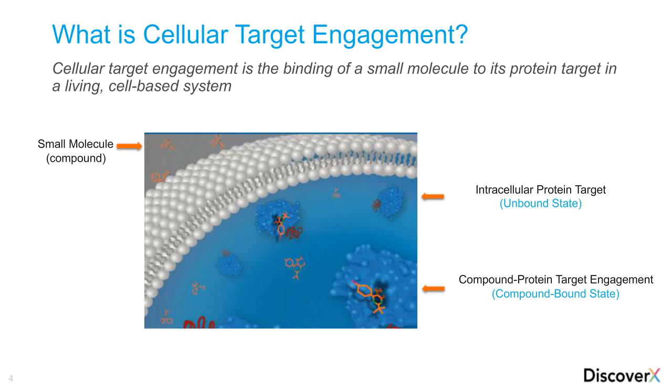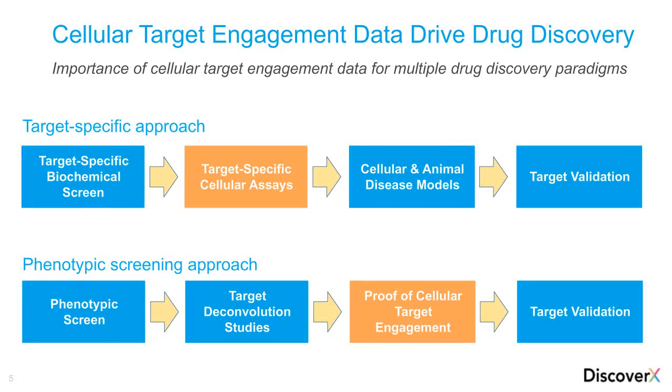change or alters the thermodynamic stability of that protein. So binding will actually change the observed steady state levels. And what I mean by steady state levels, it's the change between the degradation and the synthesis of your specific target you're looking at.